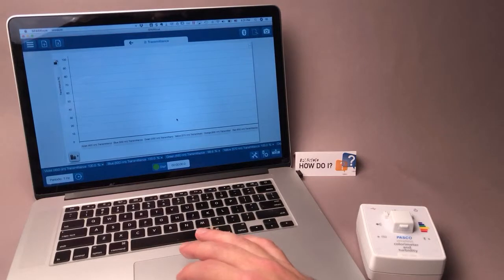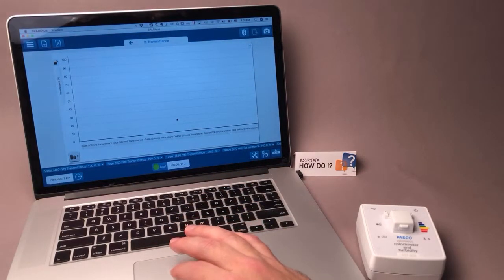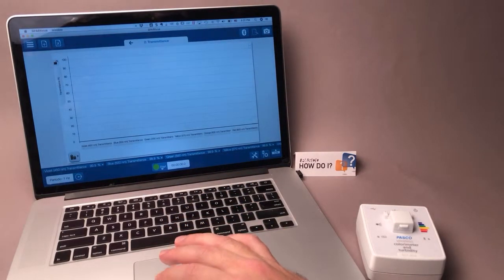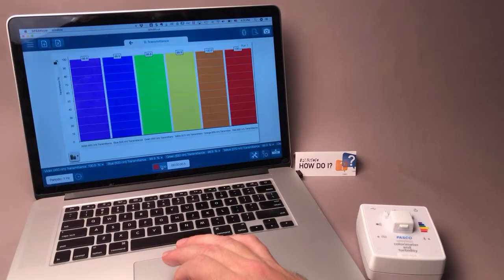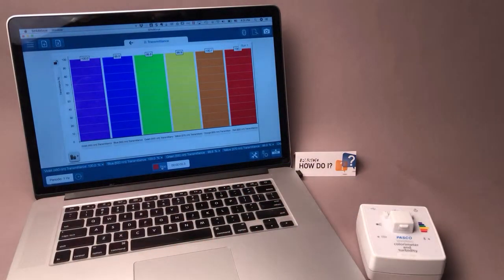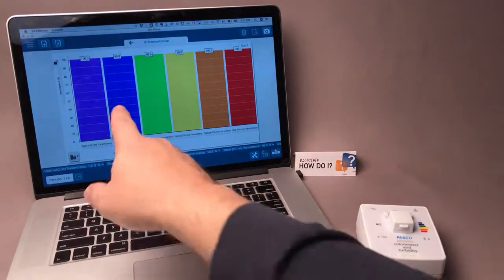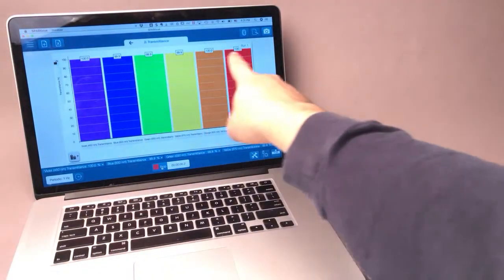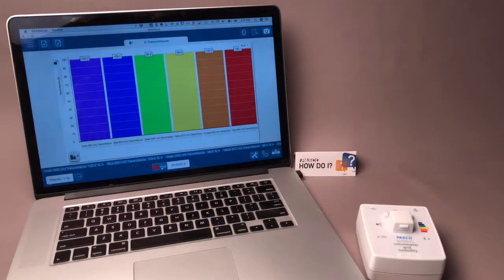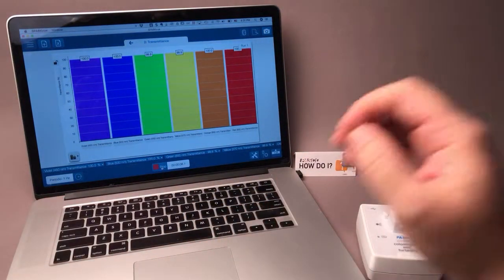And now when I make measurements with this sensor, they will be calibrated. For example, if I were to look at the transmittance of all six wavelengths of the sensor, you can see that all of them are about 100% transmittance, which is what I'd expect with my solvent.